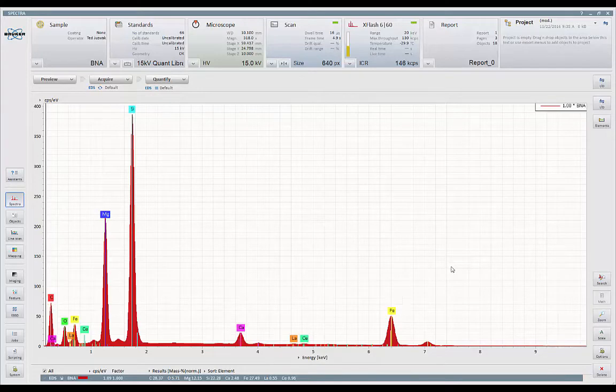Spectral acquisition is still the most basic method of analysis that we do. Under spectrum acquisition, whatever we're viewing on the SEM CRT or TEM CRT is what we're going to be analyzing. So it's that field of view. So if you use spot, line, or the overall view or a subset of that, that's what you're analyzing your data from. You have three basic operations that we do here.